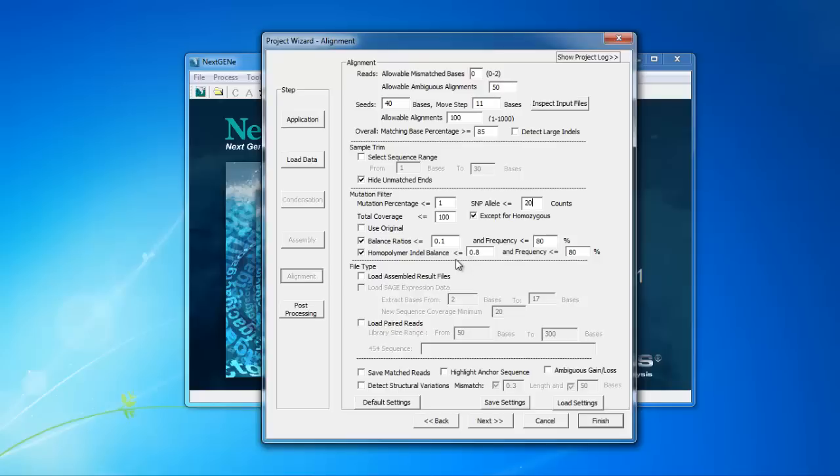The homopolymer indel balance setting checks the forward and reverse balance ratio for only indels in homopolymer regions, since these regions can cause false positive calls with Ion data and removes a mutation call where the ratio is below the threshold. Again, the frequency setting allows this balance ratio check to be skipped for higher frequency homopolymer indels.